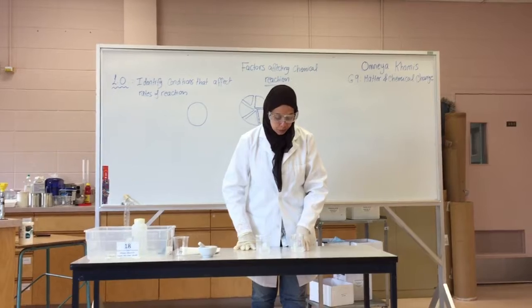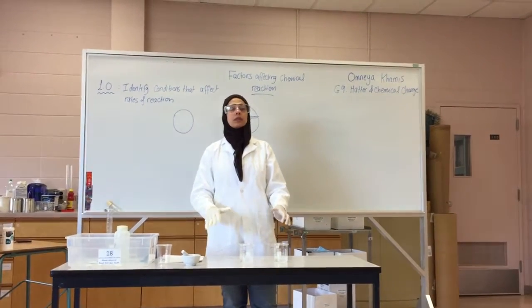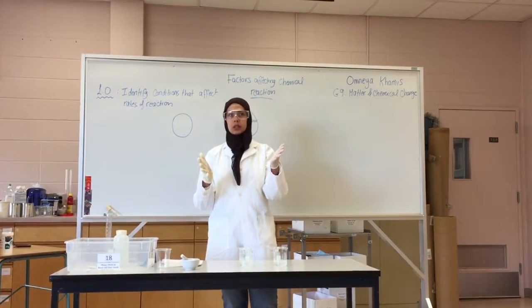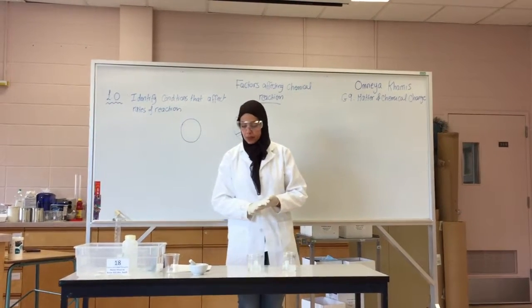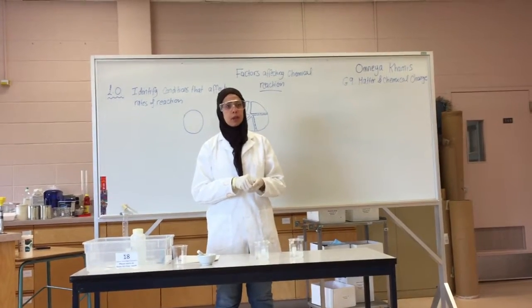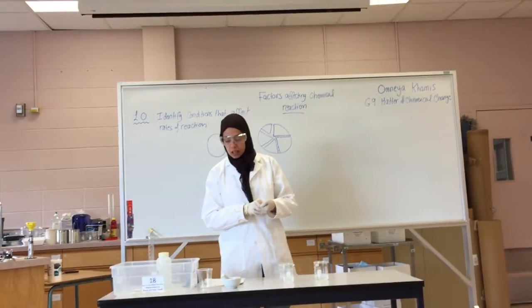And this one is still forming gas. So, any time? 120 for the tablet. And Holly, what was it for the crushed? 110. Okay, so does this confirm your hypothesis? Yes.